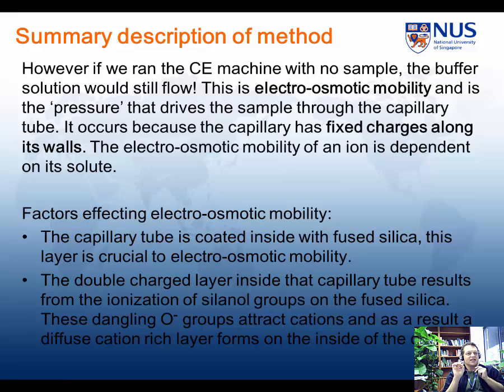The inside of the capillary with its charge structure is crucial, and effectively the double layer inside the capillary, which has resulted from the silanol group ionization, these dangling oxide ions attract cations and give you that double layer, which is the basis of electroosmotic mobility, but I think we've already talked about that.